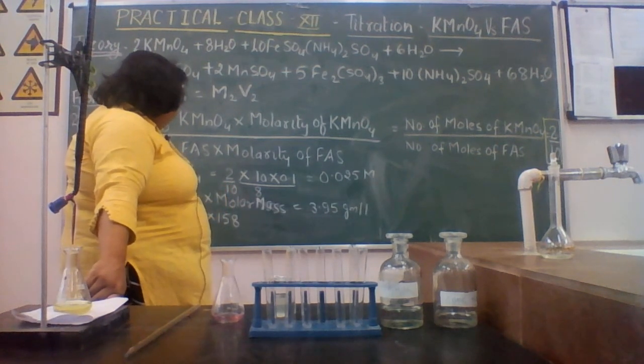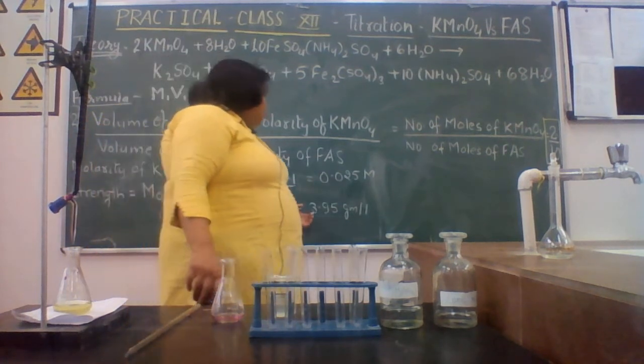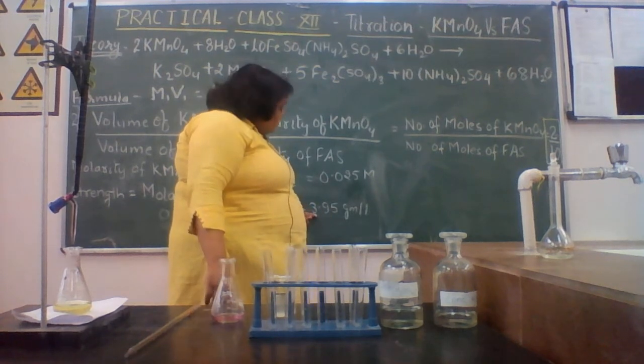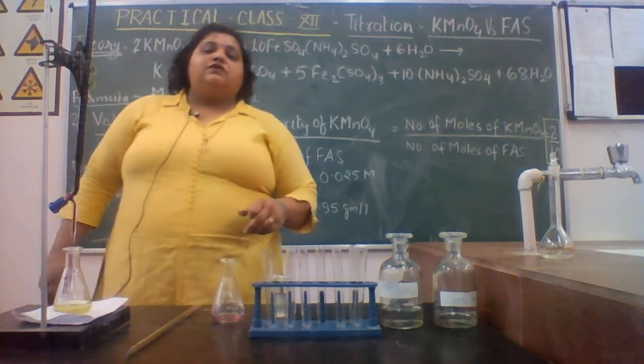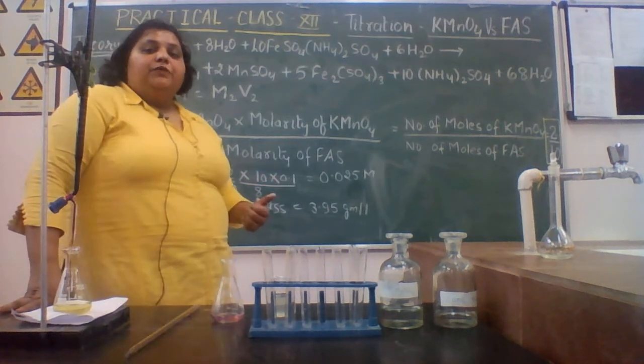So, 0.025 into 158, by the calculation I have come to know that its strength is 3.95 gram per liter. This is the objective that we have achieved here.